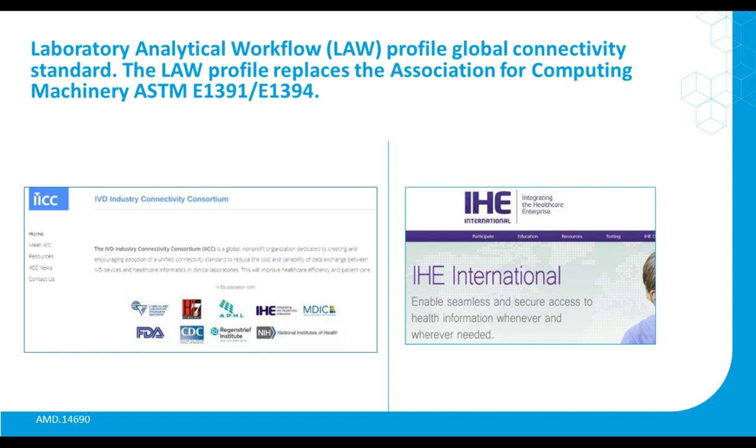The LAW, the Laboratory Analytical Workflow profile, and all these are available, by the way, on the internet, really addresses that exchange of information related to patient and QC test orders and results between systems and health informatics, because it's evolving, folks. Obviously, I think we all know that it's not there yet. The purpose of the LAW profile really is to improve interoperability between IVD testing systems and those informatics systems. And most all of our contemporary vendors out there that are producing chemistry or molecular systems have adopted the LAW profile, but not fully, so you need to be aware of that.